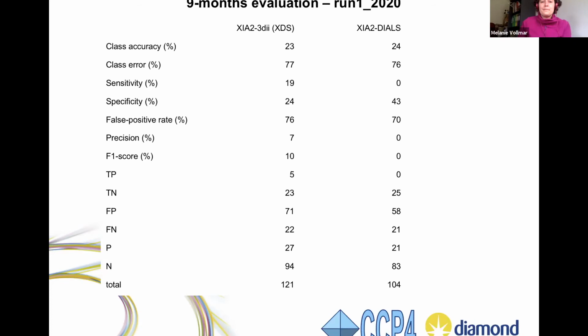You can see it essentially, the predictor for either of the 2 integration pipelines predicts none of the data sets will be able to produce a BigEP result, which they did. I mean, the BigEP still produced lovely structures. So why was my predictor not able to do that? The guess was simply that the public data we used was comparably out of date to what data we actually got off the beamline.